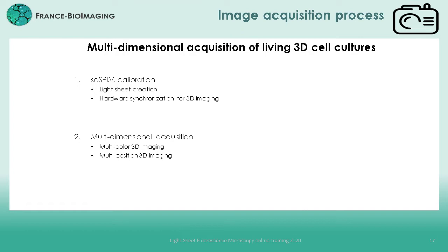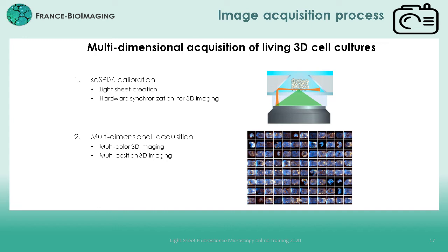Now that we have prepared our device with our samples, I will show you how to perform a 3D imaging experiment using the SOSPIN system, and more specifically, how to set up a time-lapse multiposition experiment to monitor the growth of several spheroids over time, which is a clear advantage of the SOSPIN technology. First, I will show how to calibrate the system to ensure optimal 3D imaging. Then, we will parametrize an experiment to perform 3D multicolor imaging and 3D timelapse multiposition imaging combining our SOSPIN software with the acquisition software Metamorph.